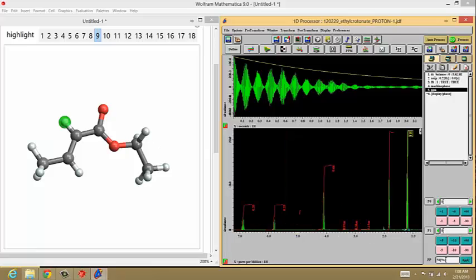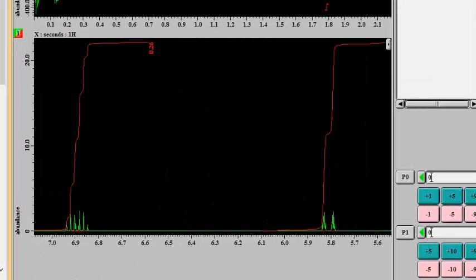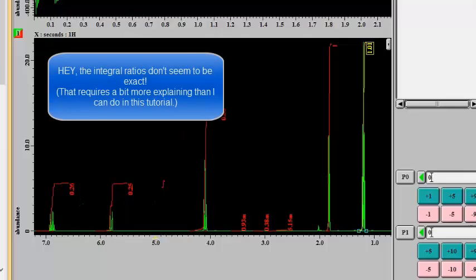If we take a look at the rest of our spectrum here, we see that this feature integrates for a small number, about 0.3. This one is around 0.25. And then this one here is around 0.67. So it looks as if we've got the largest peaks on the right, a middle-sized peak in the middle, and two smaller sets of peaks on the left-hand side.